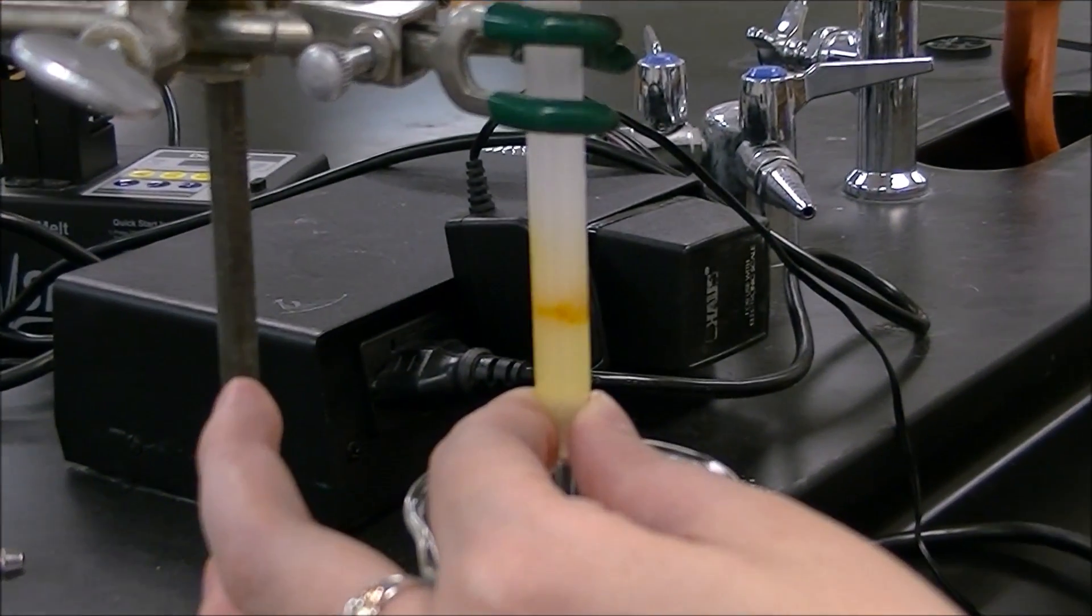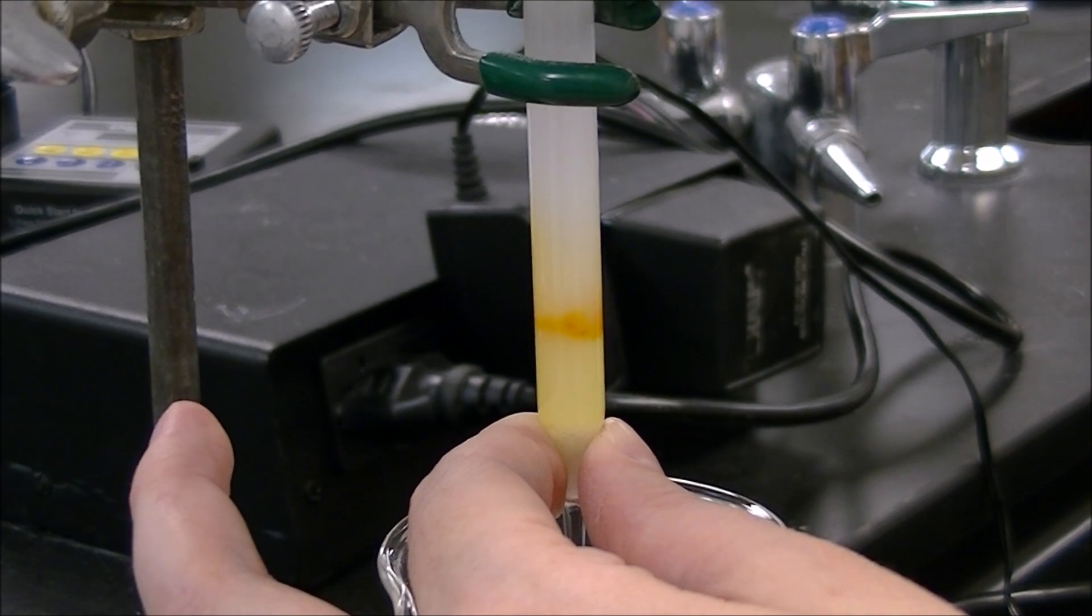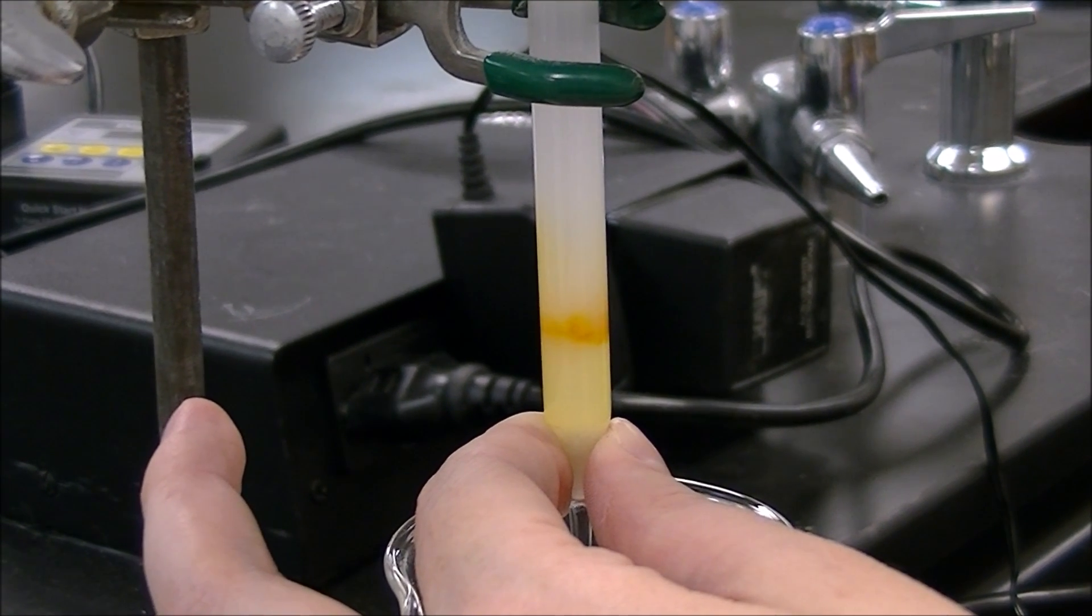Column chromatography is a purification technique that leverages differences in polarity to separate components of a mixture. In this experiment we'll be using the cis and trans isomers of azobenzene.